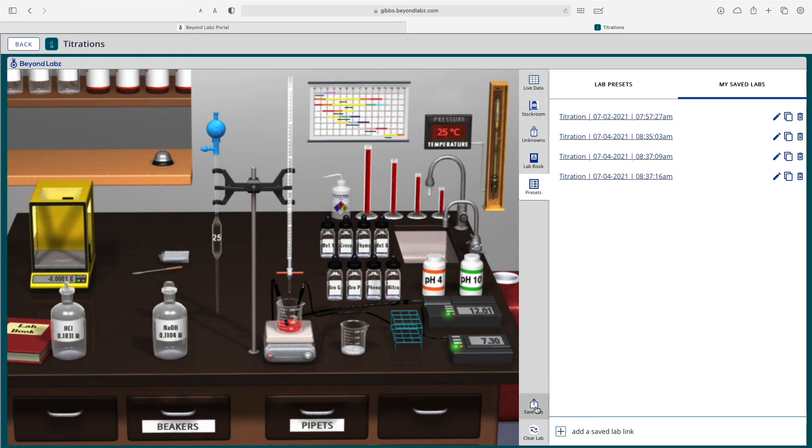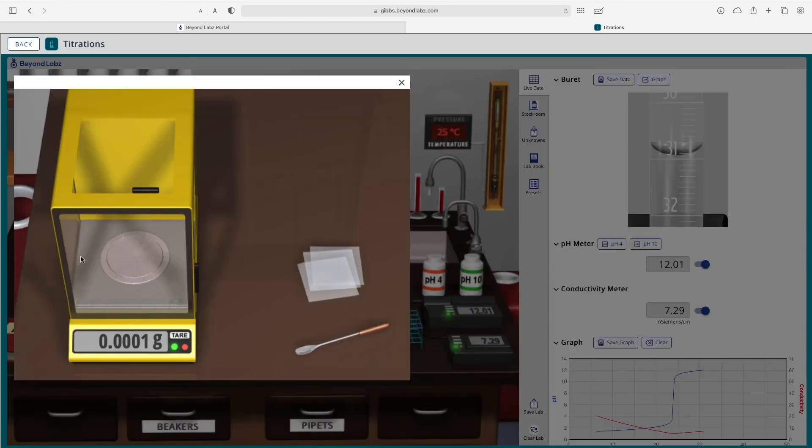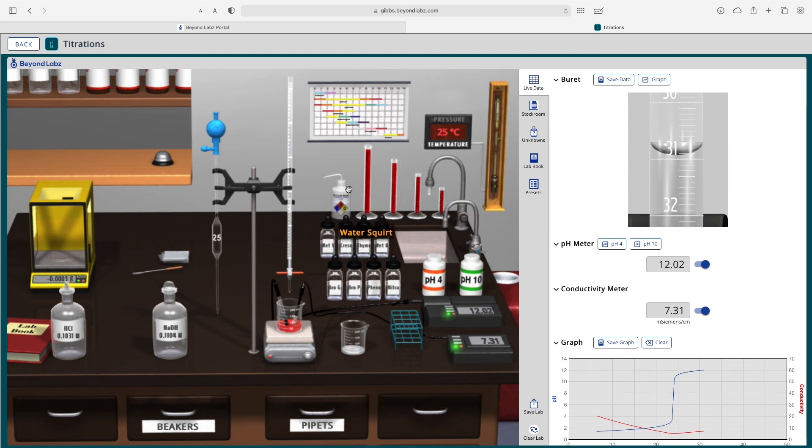You can access presets that BeyondLabs has built as well as save labs and presets that you have created yourself. If you would like to create one of those set up the lab how you would like, click save lab. Note that there are also things that you can weigh out on a balance, as well as a pressure and temperature display on the wall so you know what the pressure and temperature of your lab is at that time.